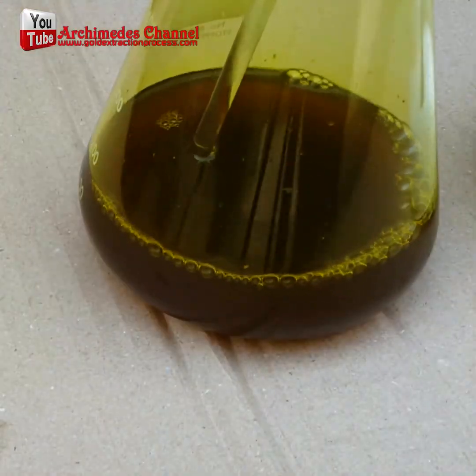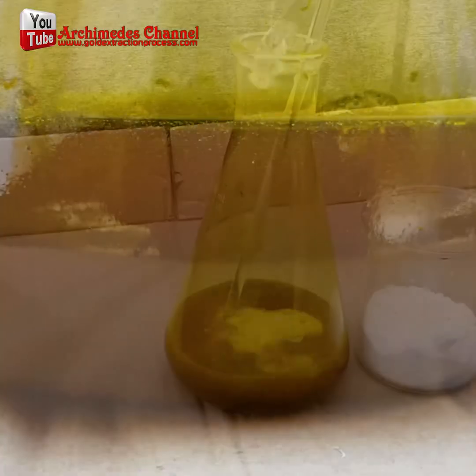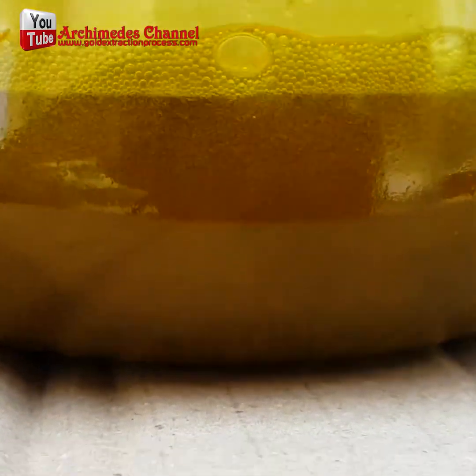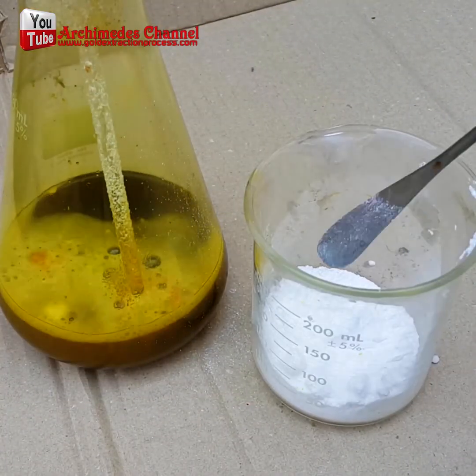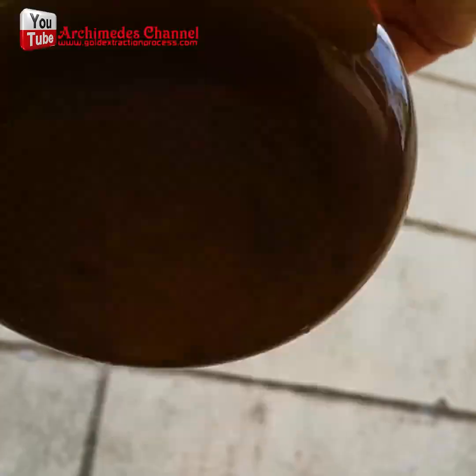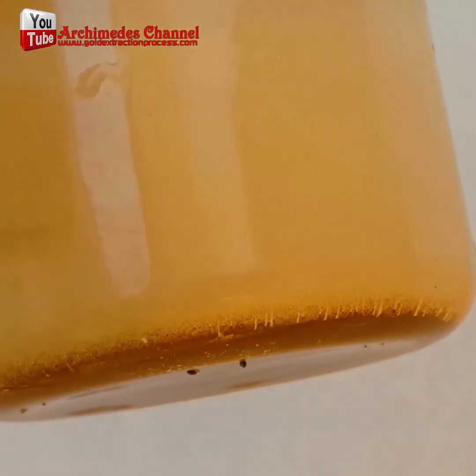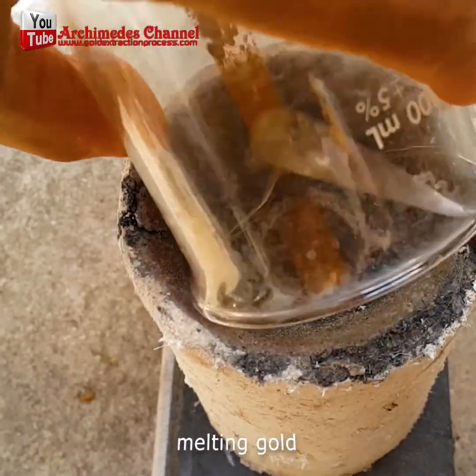A little at a time is added until the reaction starts. A little stirring until it's all dissolved. And just check the bubbling out now — you can see it fizzing. Watch what happens as a clear separation suddenly becomes clear. That's gold sitting down at the bottom of the container, rinsed out a few times to ensure none of it's been missed. And there's the good stuff down at the bottom of that beaker.